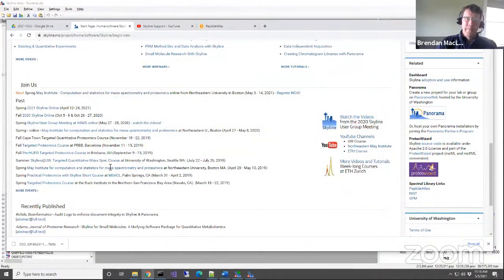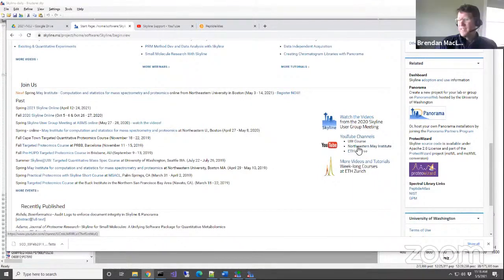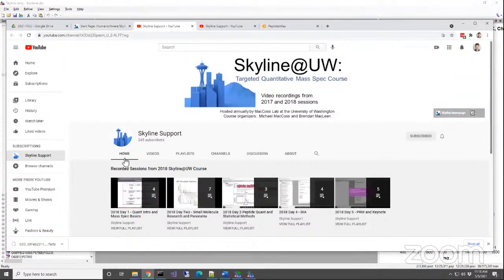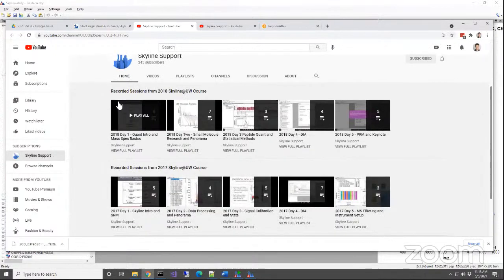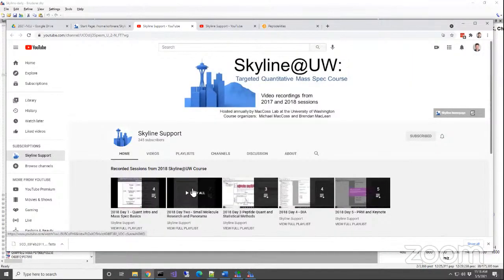And here's the May Institute listed. And then down here are some YouTube channels, which actually have past May Institutes, past courses at ETH, and past courses at UW. And the UW courses are going to be the most basic. So the most basic you're going to be able to get for Skyline instruction is to go back to 2018 day one and follow that. And then you can go as far as you like.